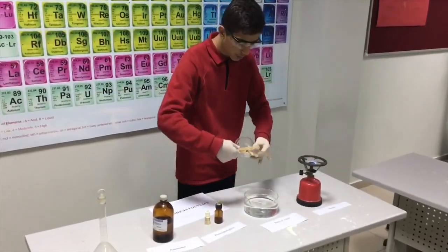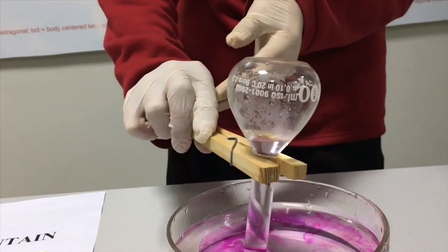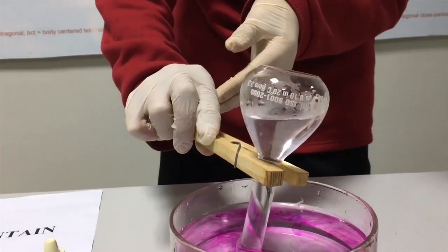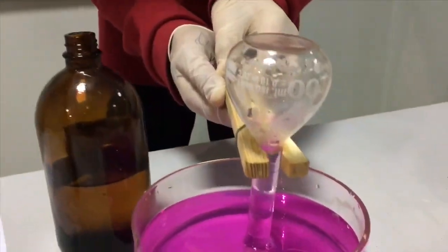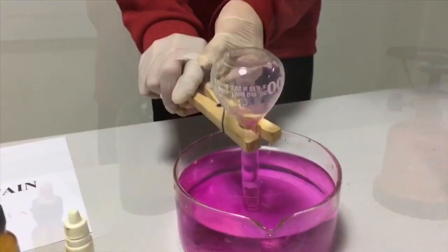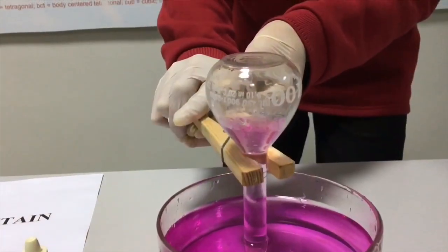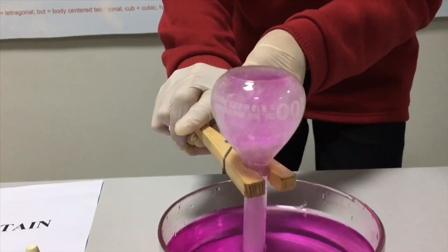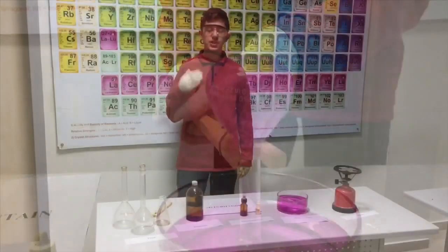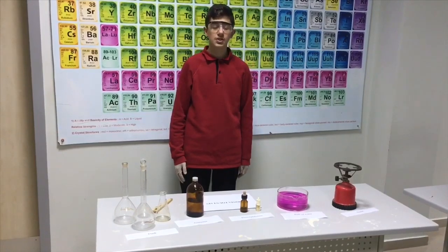We are going to put it in the belt of water. By this experiment, we learn that ammonia can be easily dissolved in water, and it shows us something beautiful.